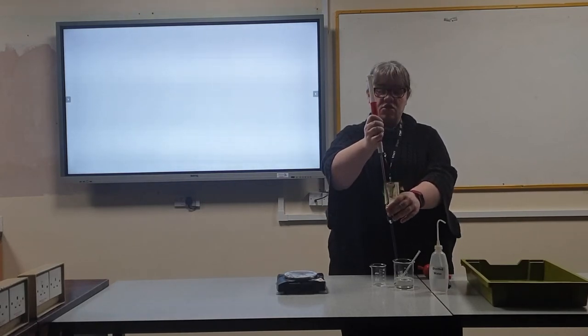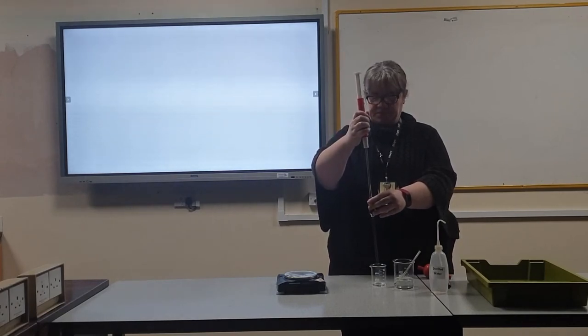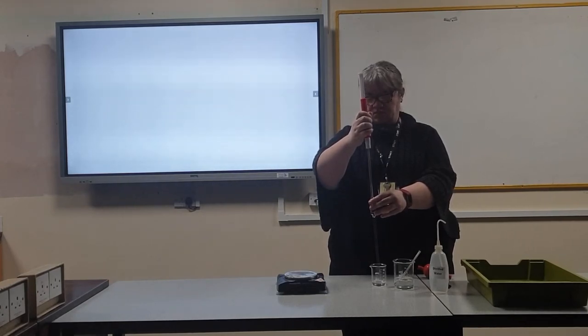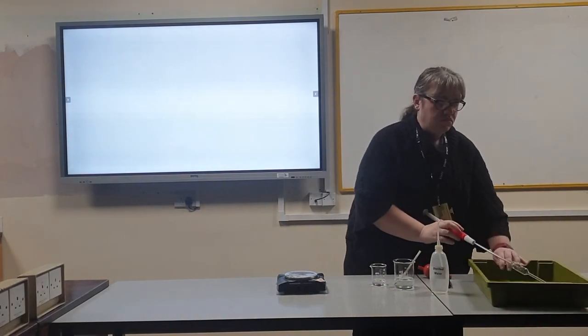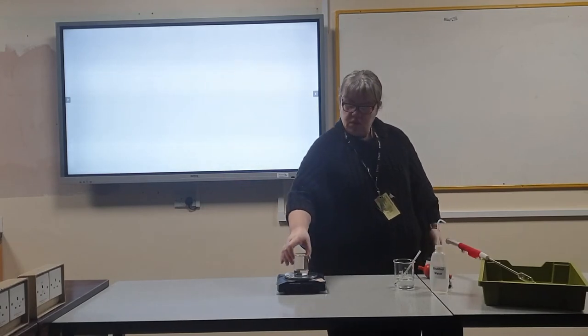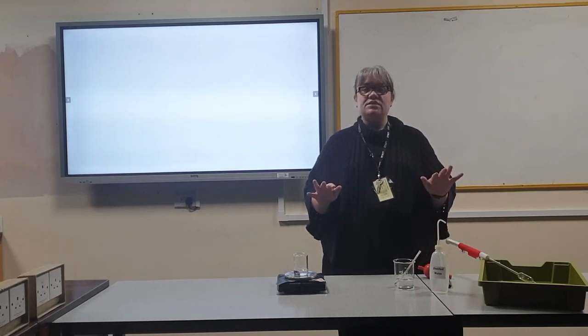When the meniscus is sitting on the line, transfer that water to the smaller beaker. Ensure that the pipette empties fully. Record the mass of the beaker plus water. Repeat this three times.